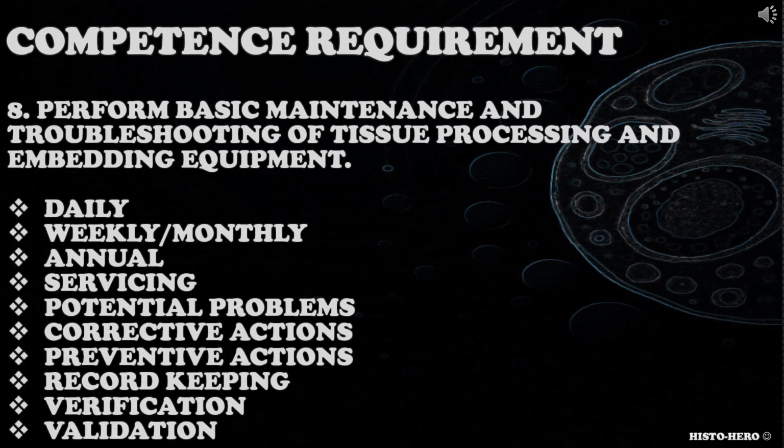The eighth competence requirement is for you to perform basic maintenance and troubleshooting of tissue processing and embedding equipment. What errors have you experienced with processing and embedding equipment in your practice? Do you know how to troubleshoot processing and embedding equipment? How often is the maintenance of processing and embedding equipment performed?